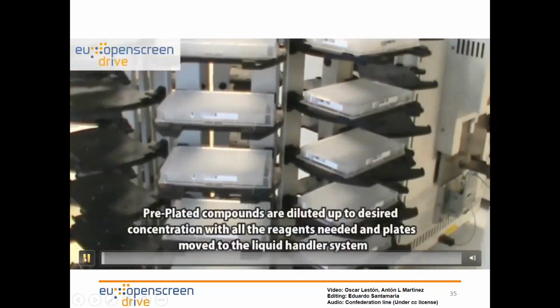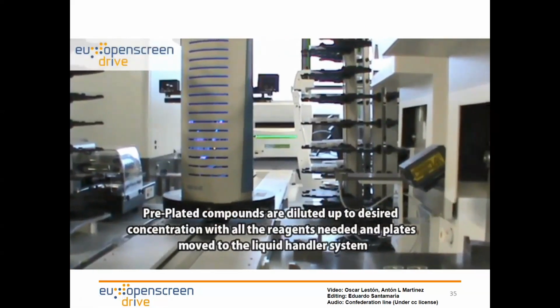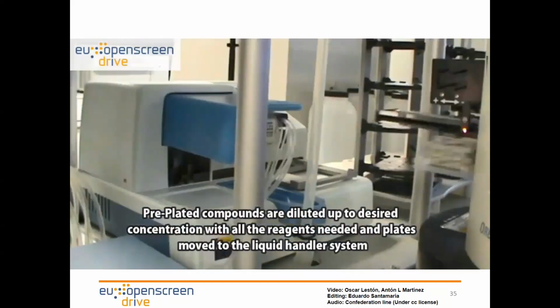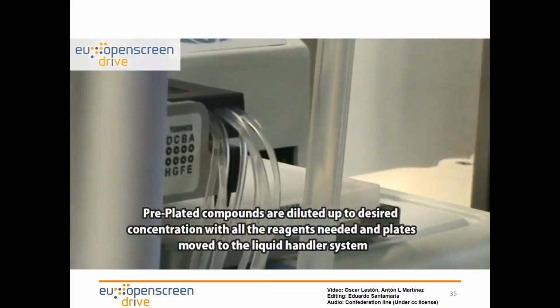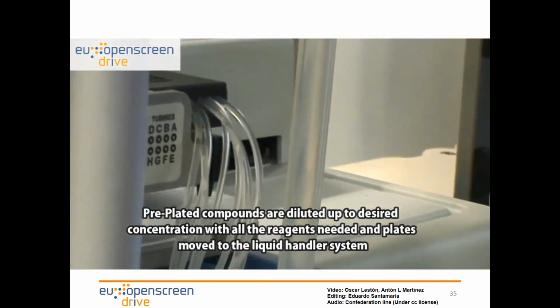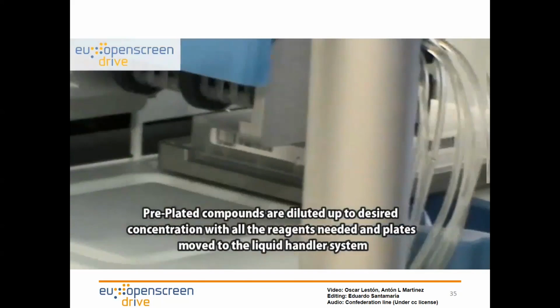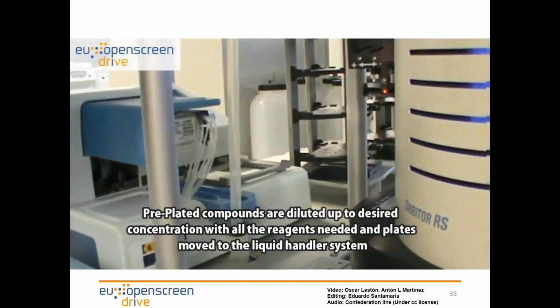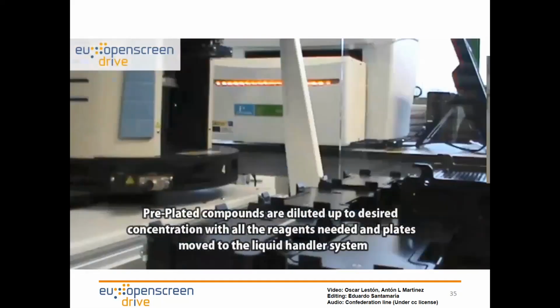This video is just a brief illustration of how high-throughput screening campaigns are run. In this video, you can see how the compounds are already prepared and diluted in order to obtain the desired concentration for running the campaign. With this dilution, it is always better to have a single step where you can add all the reagents needed, if possible, to the compounds, and they are then moved to a liquid handling system that is going to add the compounds onto the cells, where we are going to measure the effect of the compounds.